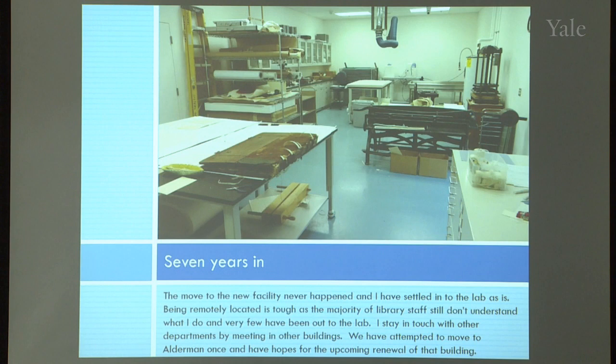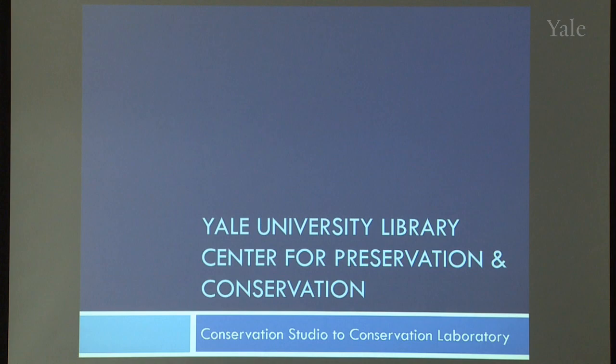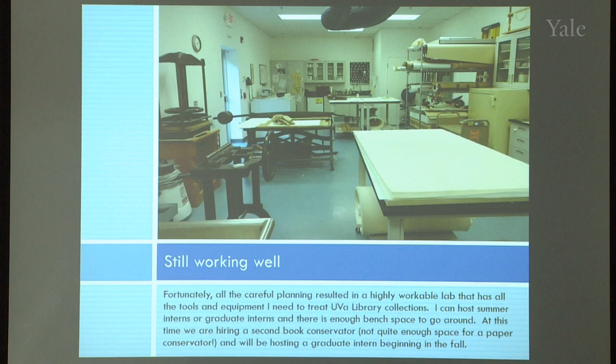So those are some of the drawbacks. But that said, you can do a lot in 663 square feet. If you look back to where the pegboard is over the washing sink, to the right, there's this big white square box. That's the air handler system.